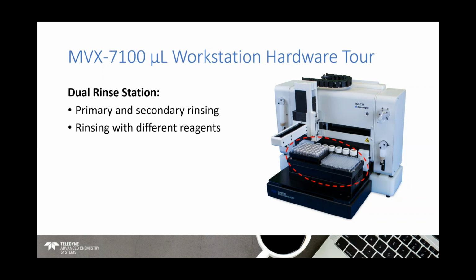And then just on the other side of this, there is a dual rinse station as primary or secondary rinsing for your sample probe, or you can rinse with different reagents. So again, you can configure your system to the kind of analysis that you're doing.